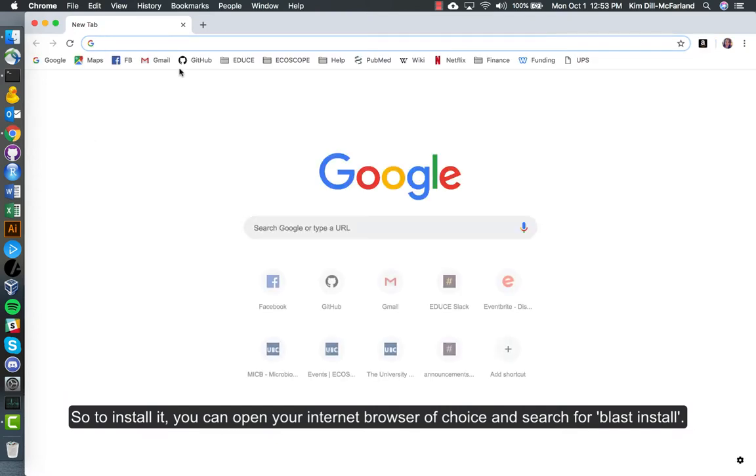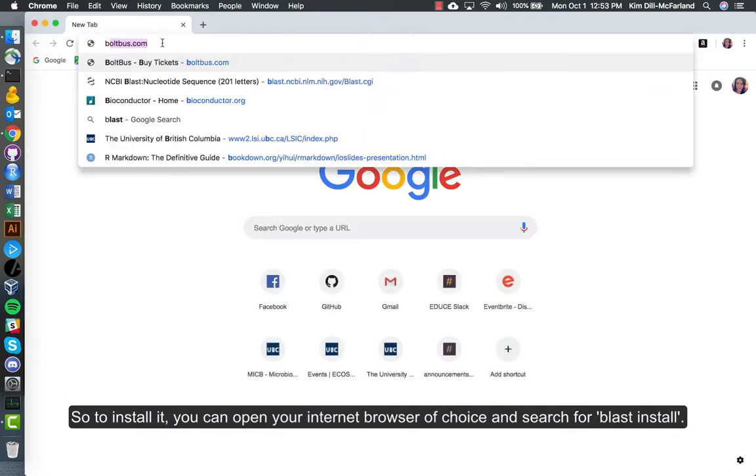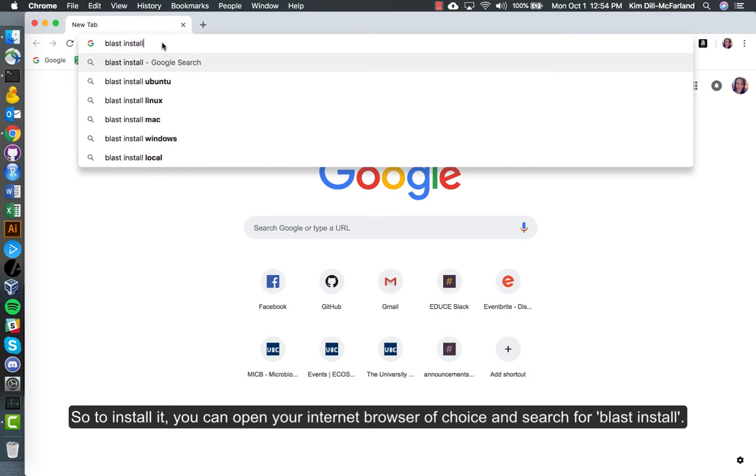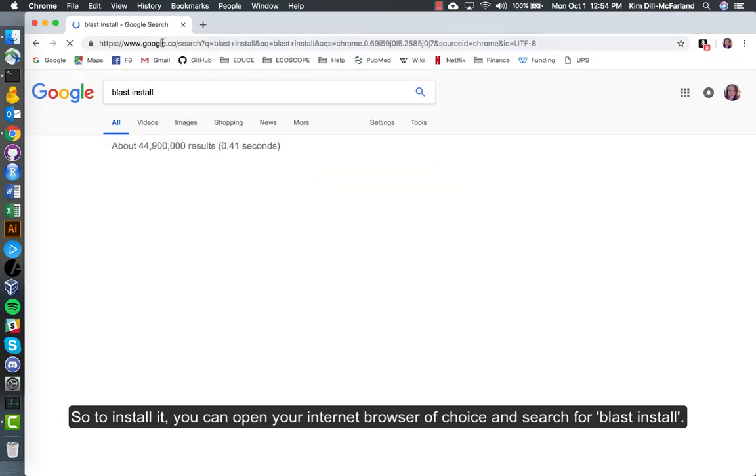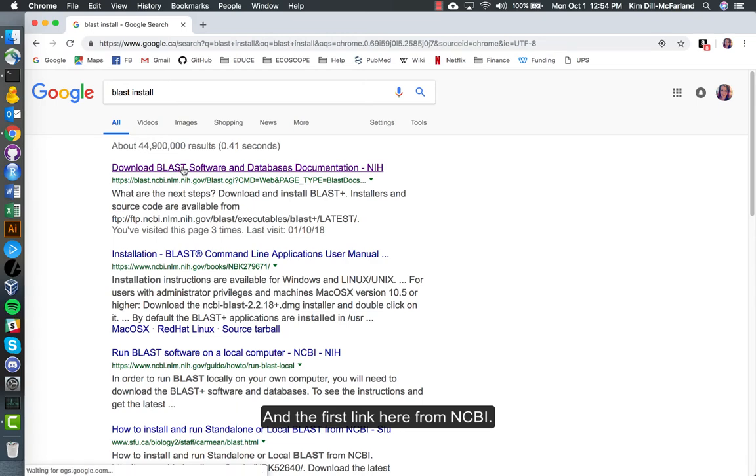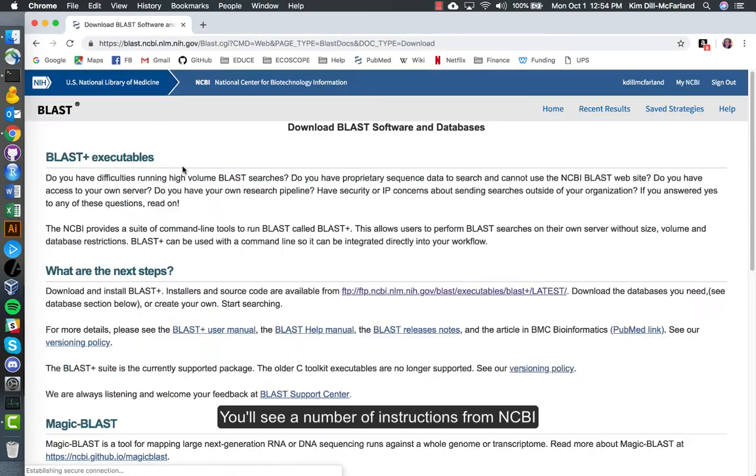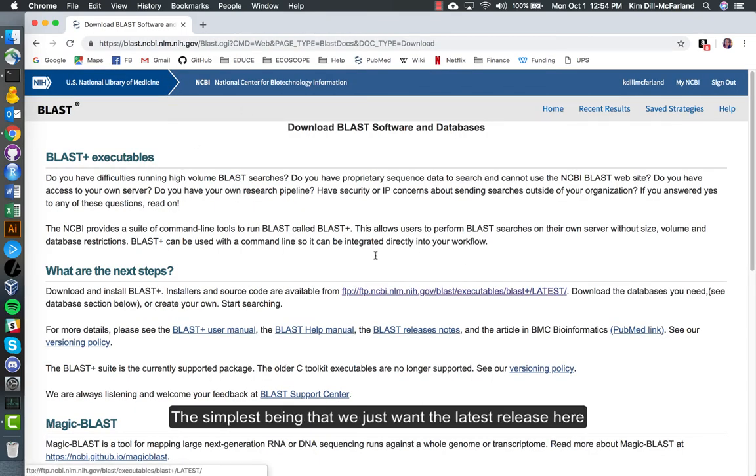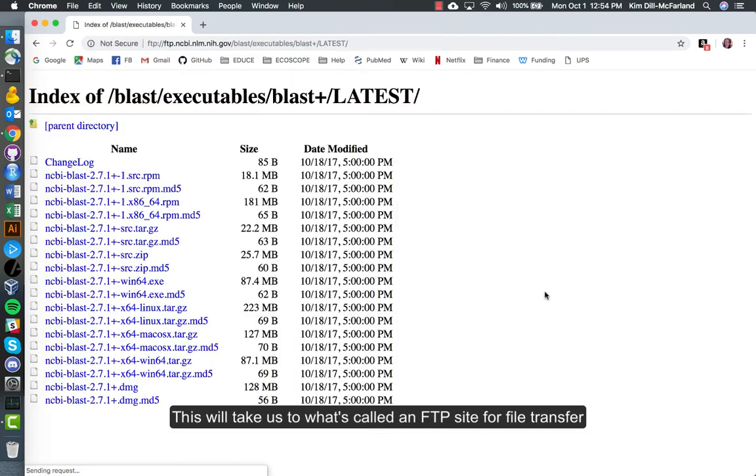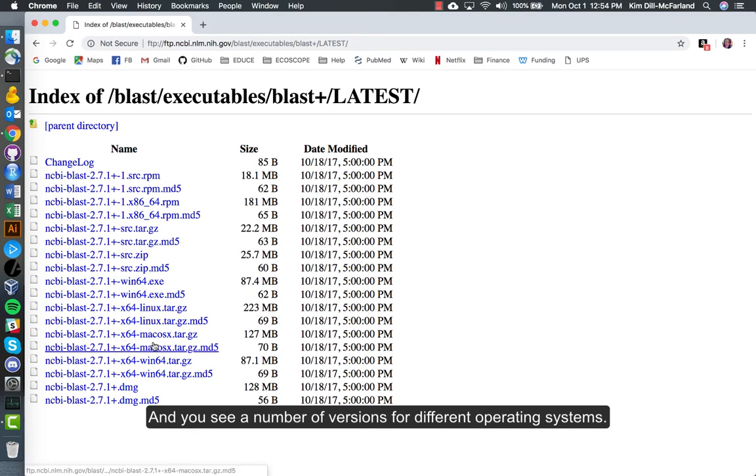To install it, you can open your internet browser of choice and search for blast install. The first link here from NCBI, you'll see a number of instructions. The simplest being that we just want the latest release here, whatever version is the most up-to-date. This will take us to what's called an FTP site for file transfer, and you see a number of versions for different operating systems.